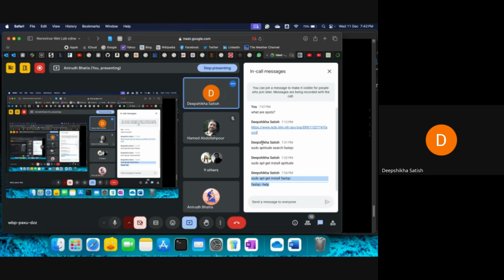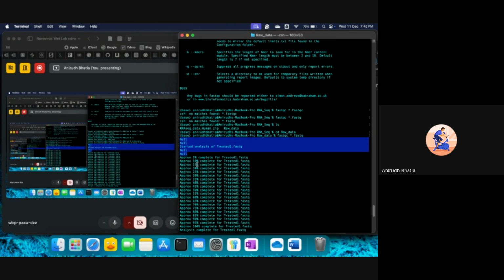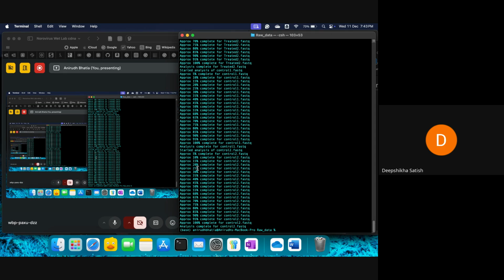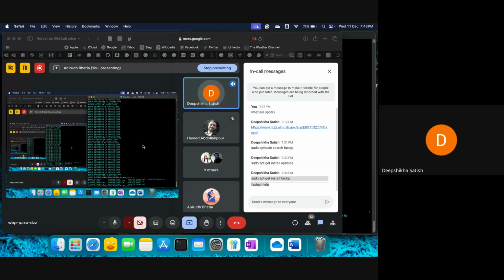Yeah. So when I ran this command, in the beginning it just shows me null, null, null, and started analysis, and then null, null, null. So this is not similar to what you were seeing, right? Okay, just scroll down. Put ls here, sir. Okay. No worries, sir. This is not an error, sir. Yeah, it is perfect.